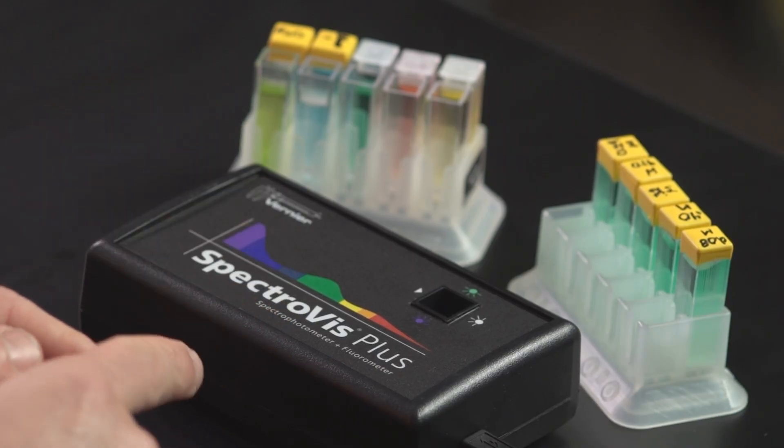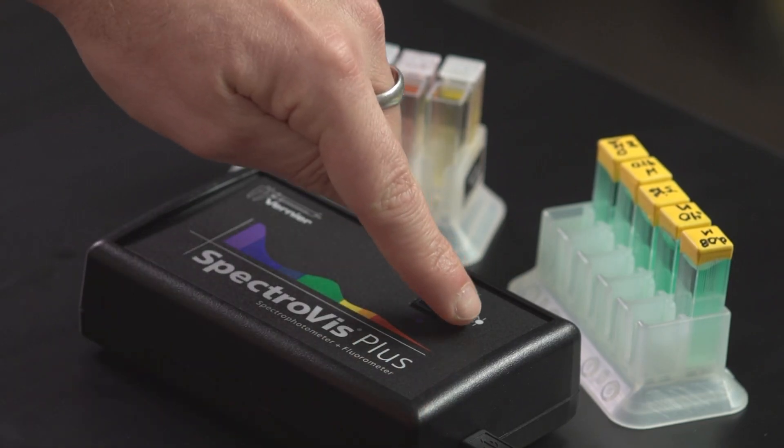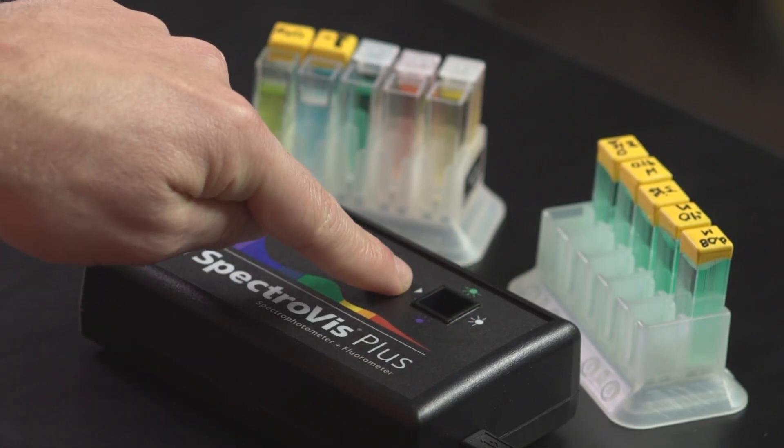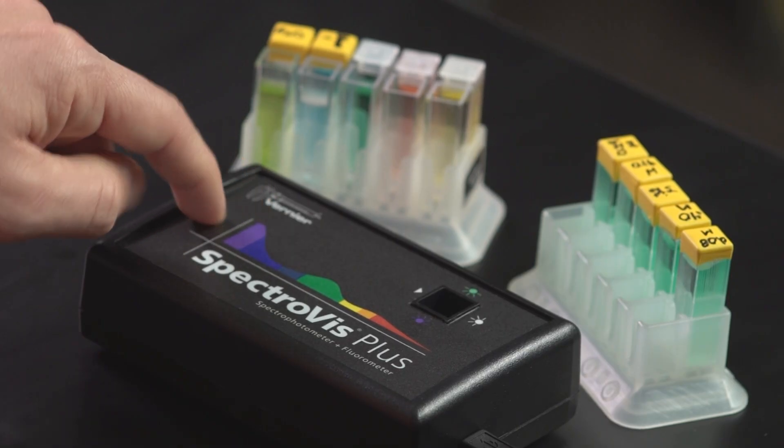How this device actually works is there's a little light source right here, and the light travels through the cuvette. It goes through a little diffraction grating. And after it goes through the diffraction grating, that light — that little rainbow of color — is spread across a little detector which is in the back of the device. And that little detector is what can show us all of these wavelengths simultaneously.